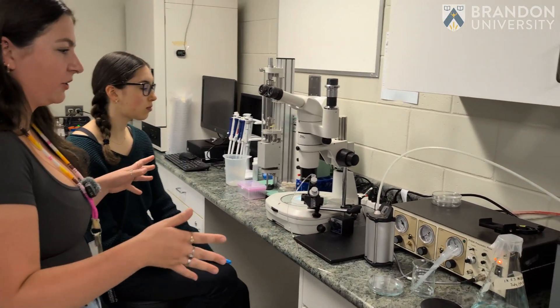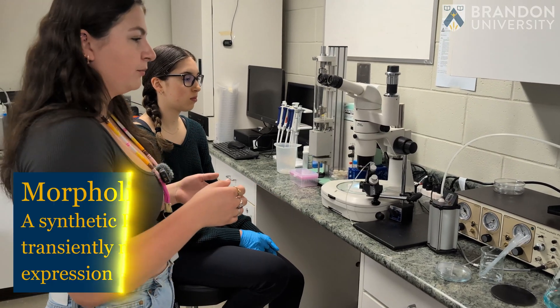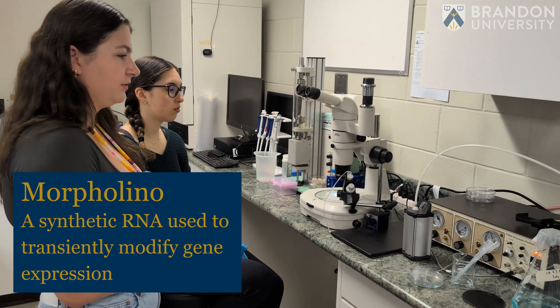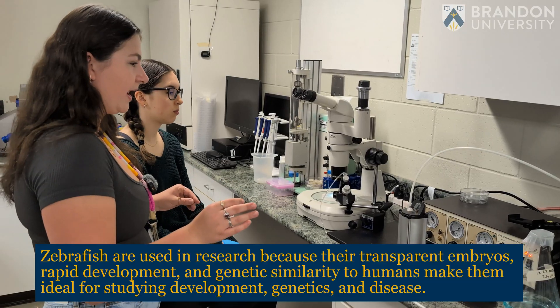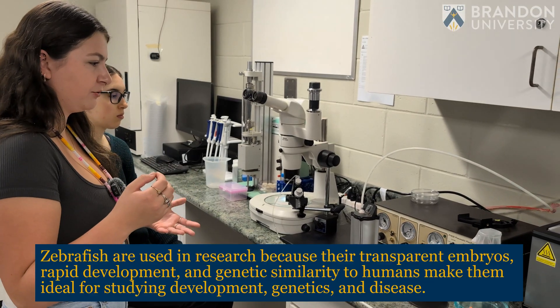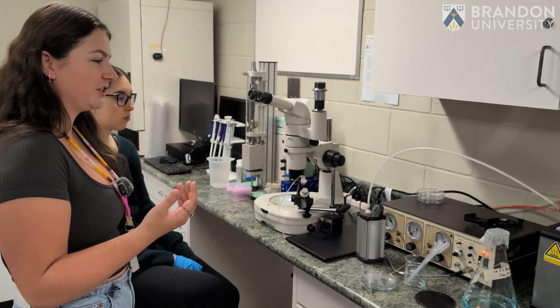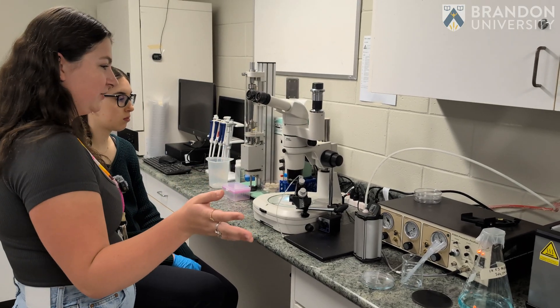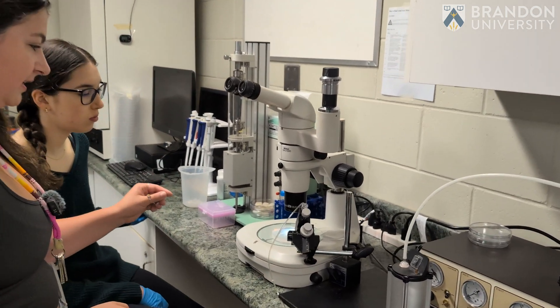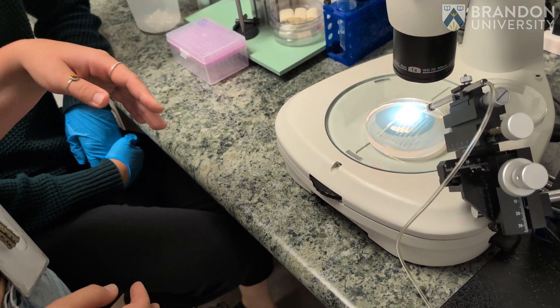Here we have our little micro injection setup. This is used to do some of our morpholino knockdowns on different genes in zebrafish embryos. We use a few different pieces of equipment for this. We have a pico pump which is just putting an amount of air through this tube, which helps to actually do the micro injection. It's connected to a gas source, and then here we have something called a micro manipulator.